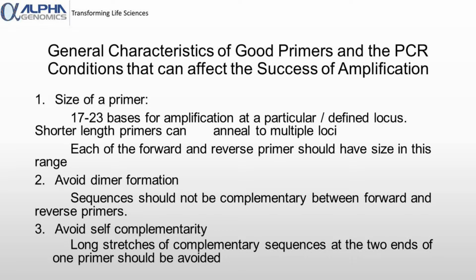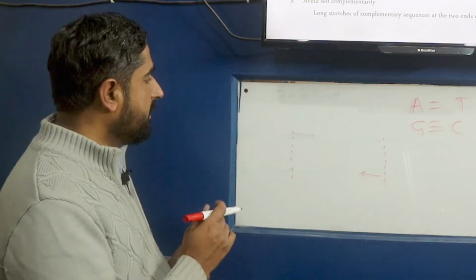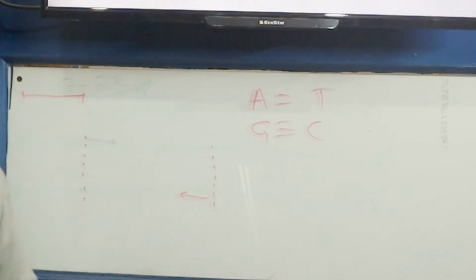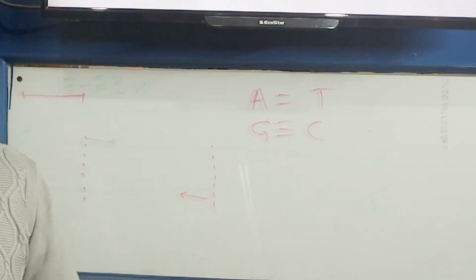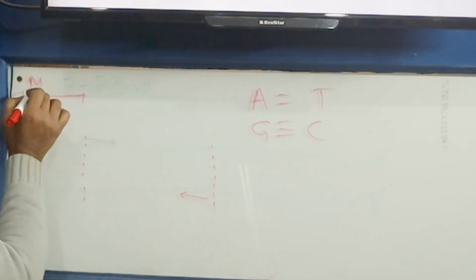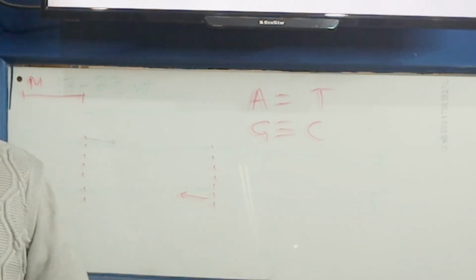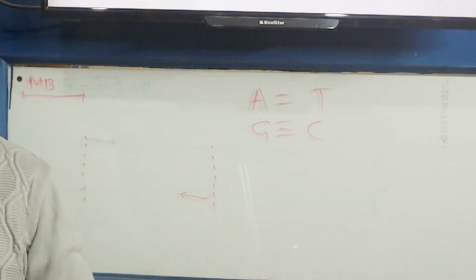Depending upon different uses, we can custom design primers of a longer range. For example, we can add non-specific tags onto this region. If we want to pool different reactions for other applications like NGS or amplicon sequencing, we may need to add M13 tails towards the 5' end of these primers.